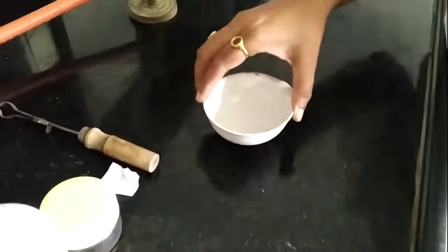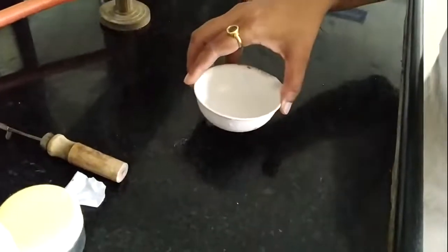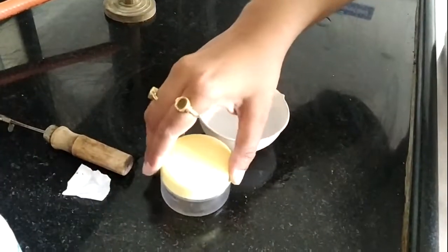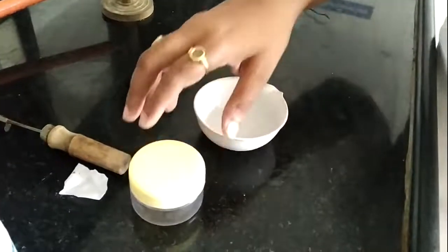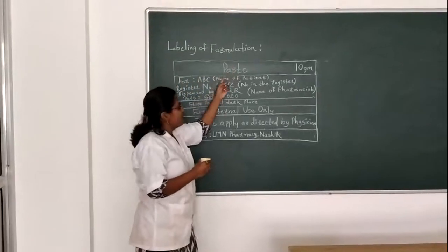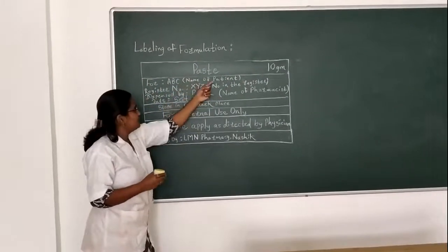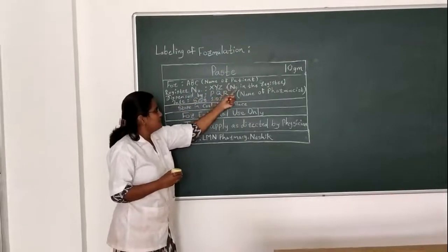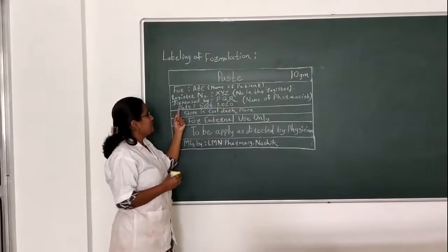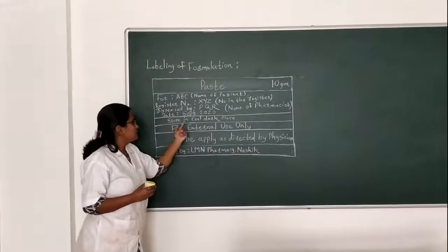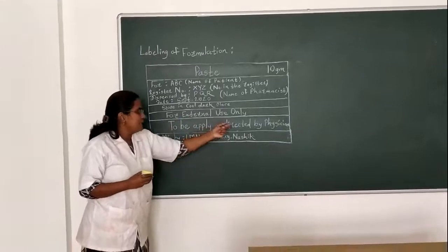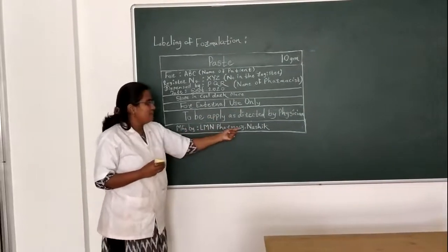I poured this thick paste into a shallow evaporating dish instead of a shallow tray, and then transferred it into the container. We will now proceed to the labeling part. The label includes: formulation paste 10g, patient name, register number, dispensed by pharmacist, manufacturing date September 2020, stored in a cool and dark place, for external use only, to be applied as directed by physician.